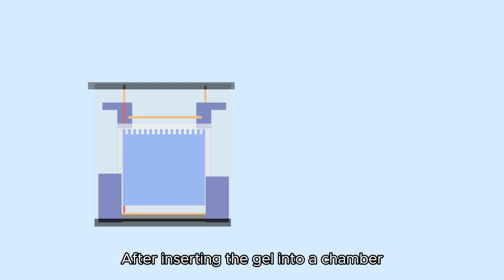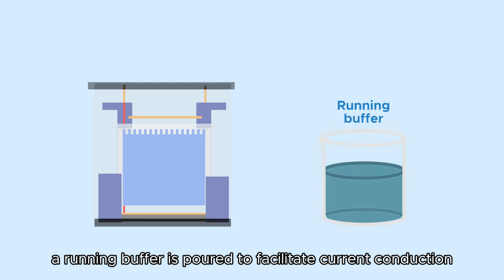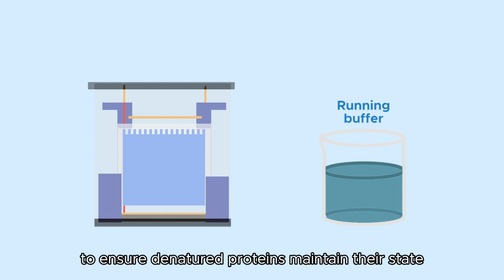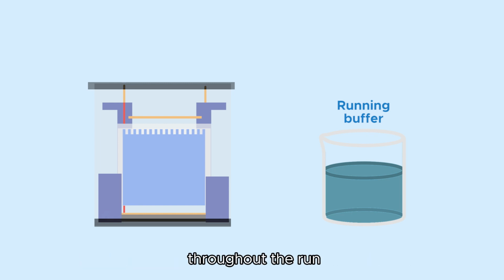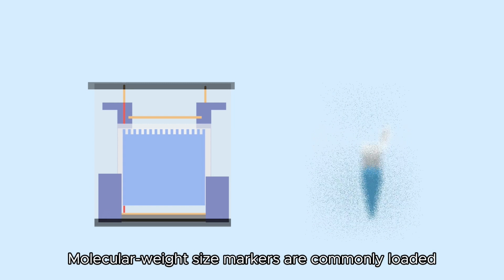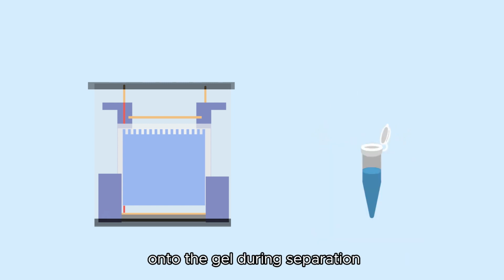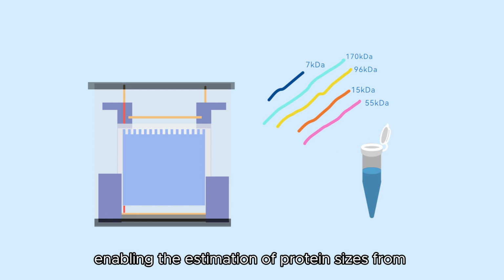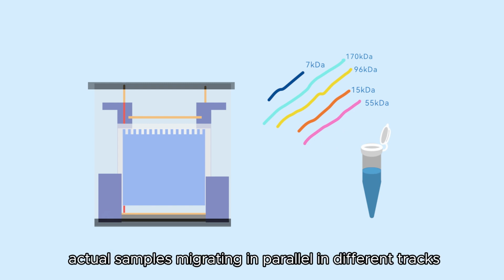After inserting the gel into a chamber, a running buffer is poured to facilitate current conduction. SDS is present in both the gel and the running buffer to ensure denatured proteins maintain their state throughout the run. Molecular weight size markers are commonly loaded onto the gel during separation, enabling the estimation of protein sizes from actual samples migrating in parallel in different tracks.